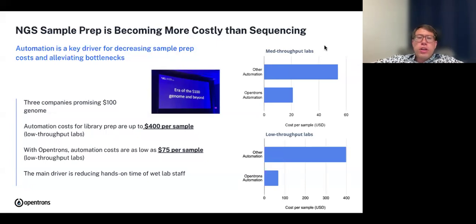even earlier this year, Illumina was talking about their customer base and particularly the needs of small and medium-sized labs, where, as sequencing costs have gone down, in their view, at least with respect to their customers, it's the first year that the sample prep costs, the labor costs and time associated with that sample prep exceed the actual end sequencing cost.